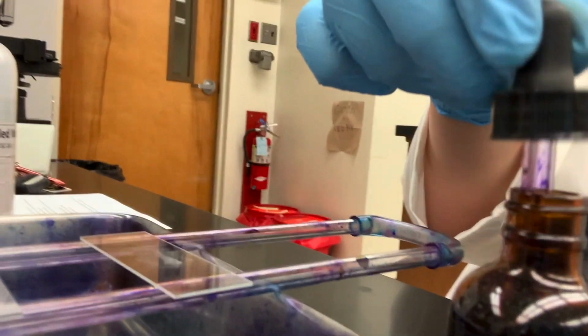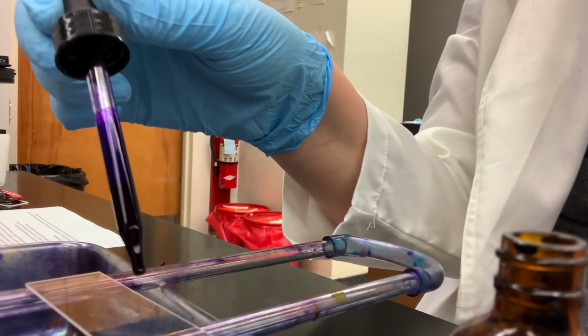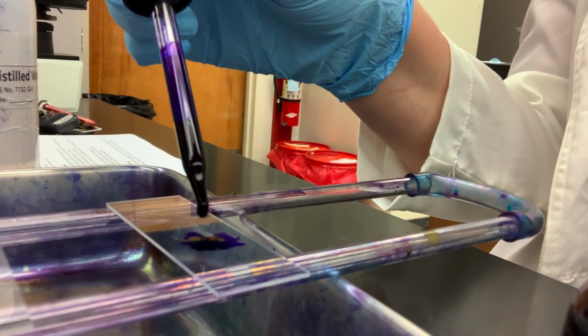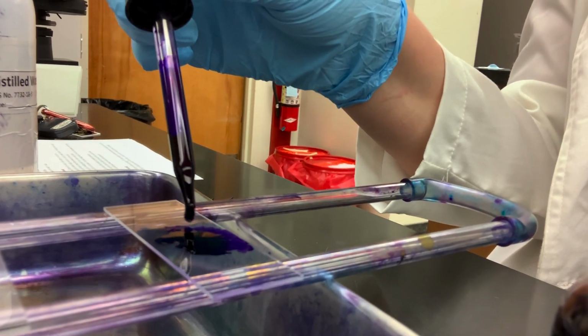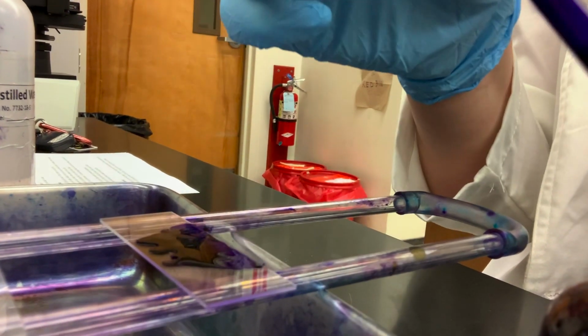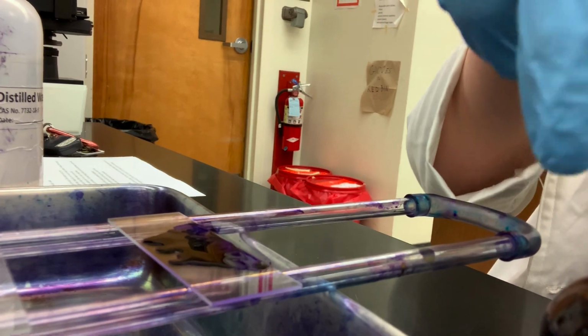So here are my slides, and I'm going to add crystal violet so that it covers where I streaked the cells. And now we wait for 1 minute.